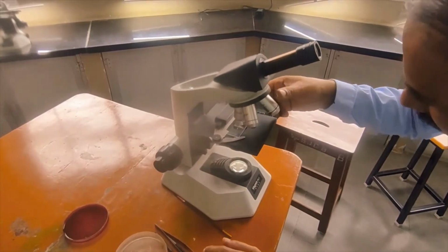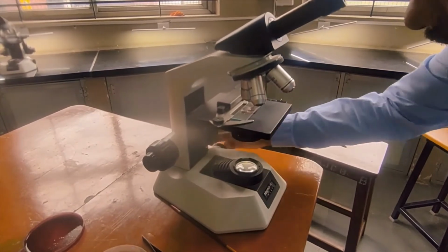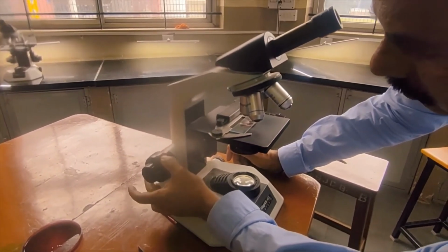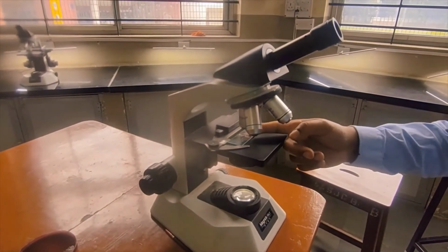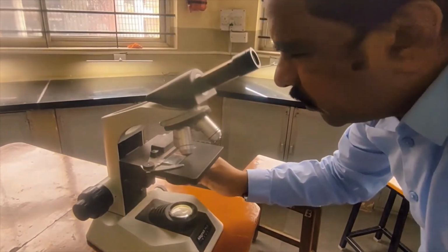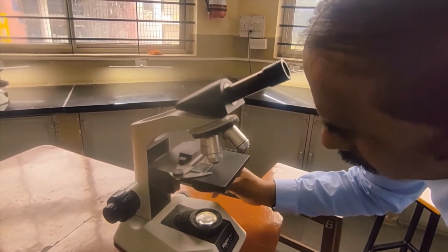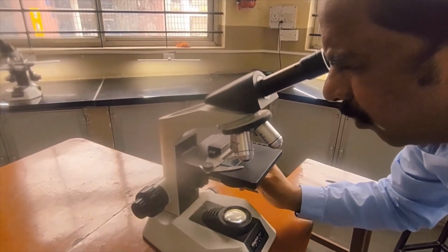There are different objective lenses, so you can use the smaller one, which is the low power, and then you can move it up and down by using these knobs. The bigger one is the major adjustment, and this is the minor adjustment. Now what you require is about 1 centimeter gap between the slide and the objective. Then you see it through the ocular lens, and use this knob to move the slide up and down, front and back, so that it comes into focus. Yes, the slide is focused.